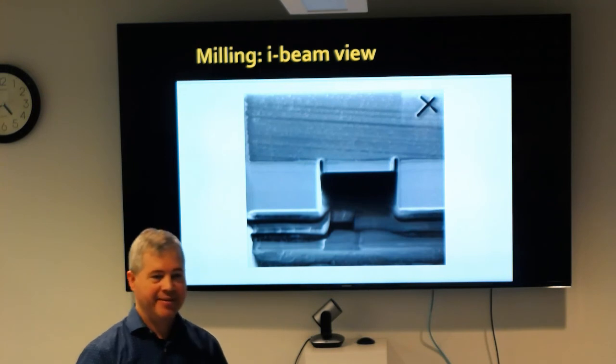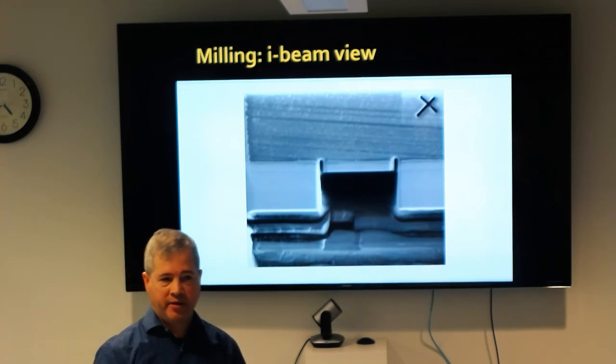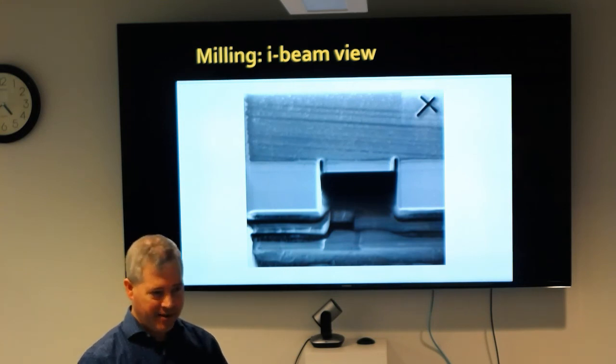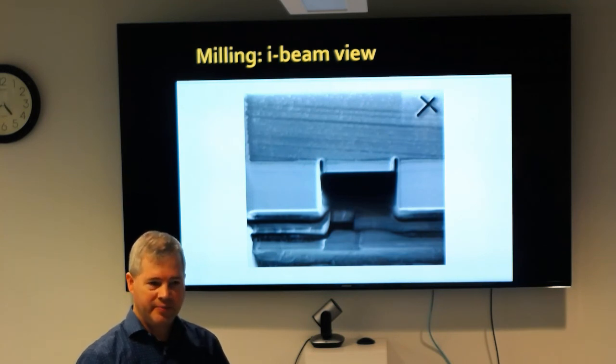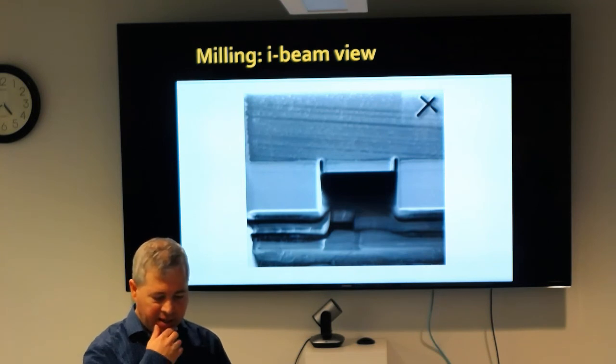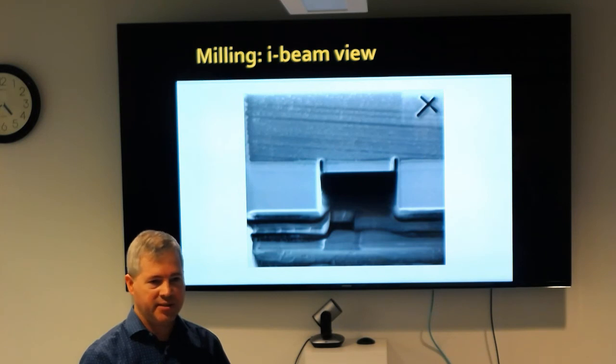Do you get down to like 2 kV for the ion column? The ion column we actually always run at 30 kV. You do? Yeah, I think there's no reason for us to lower the voltage of the ion column. We haven't detected any, and there've been several. I think anyone doing it also has not detected any crystallization, so it seems not to heat it too much when you're cutting it.